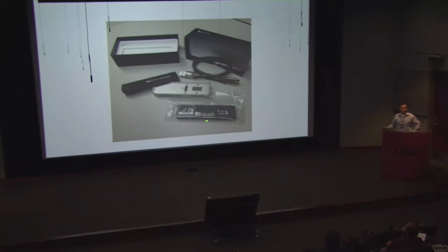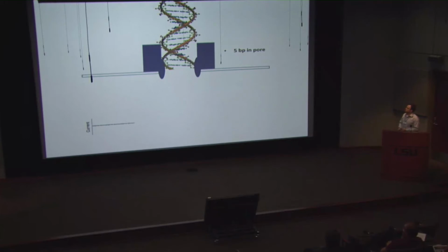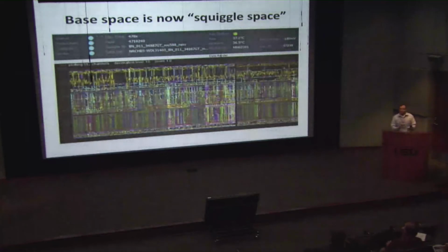They're this big, and you can plug them into a laptop and do sequencing. And it depends on the fact that as you put DNA through this pore, you have 5 bases at a time that are being measured. And so essentially you look for a hidden Markov model to build the profile of DNA as it moves through the pore like this. So if it's 5 bases at a time, you assume ACGT, that's 1,024 possible states. And so they build this model and try to measure things as they move through the pore. This is what the raw data looks like right now, so it's not quite ready for prime time, I'd say.